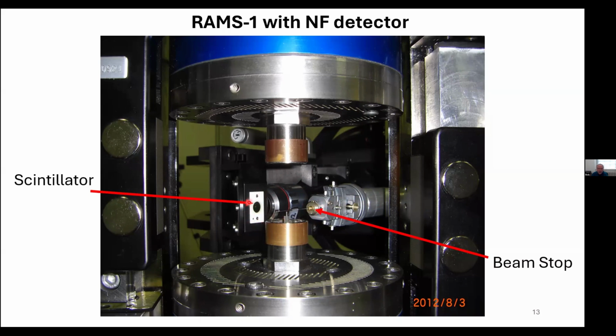This plastic piece here holds a little lutetium aluminum garnet sample crystal, which is a scintillator. So it absorbs X-rays and emits visible light, which goes into a lens, which goes back to a CCD camera. Well, currently we've graduated to CMOS instead of CCDs.